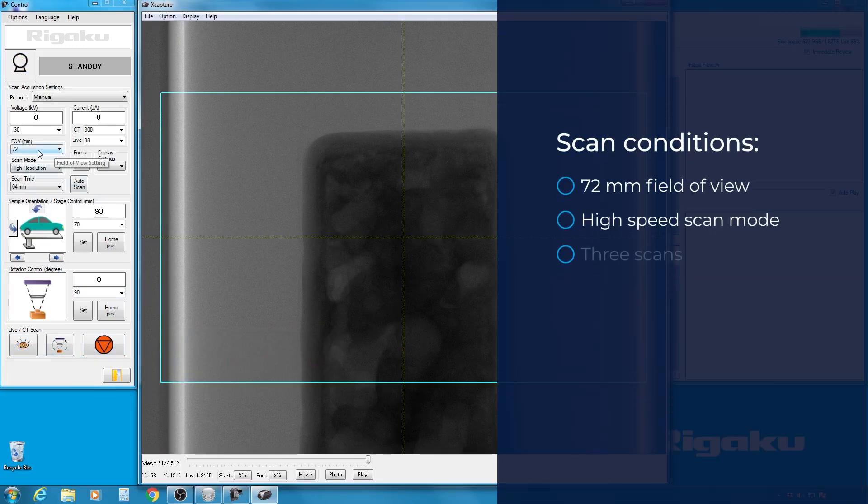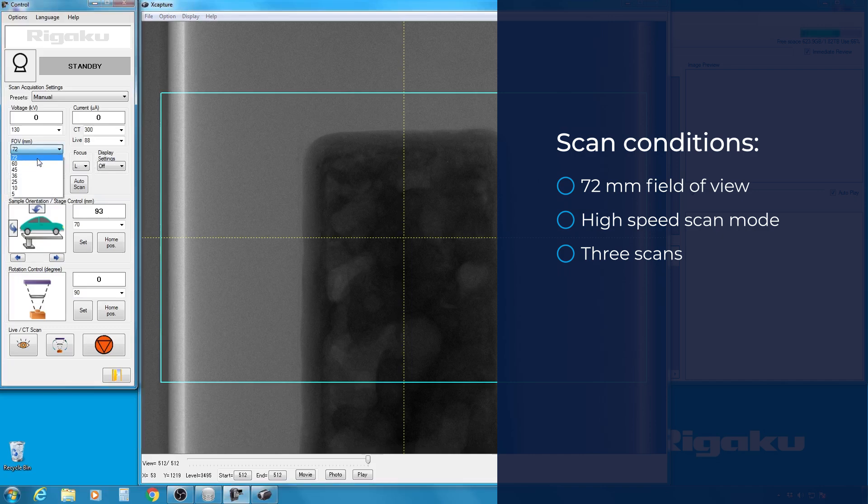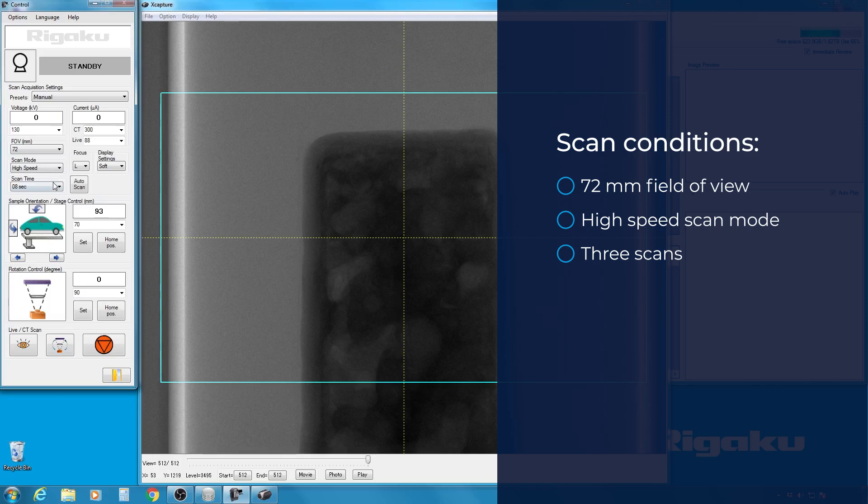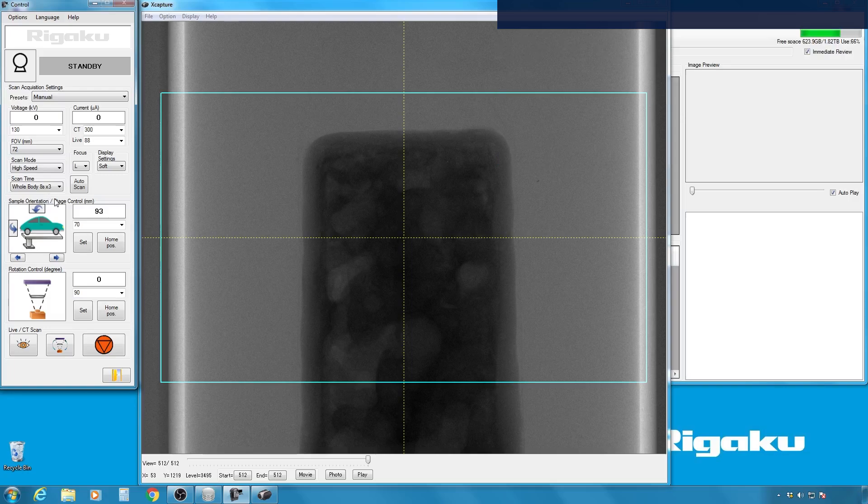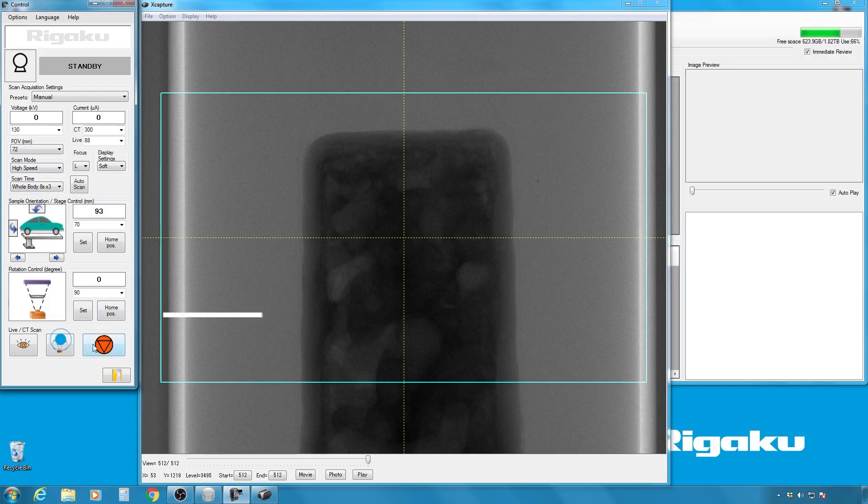I will use a 72 millimeter field of view and change the scan mode to high speed to do this very quick. And I will do three scans to cover the entire sample. And click CT scan.